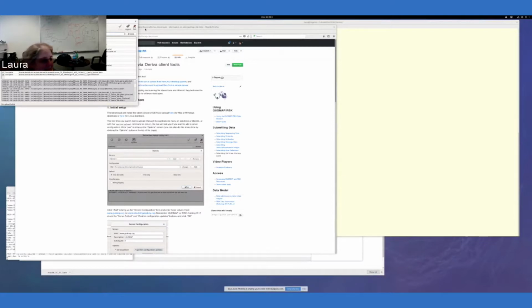You can log out and you can exit, but does anyone have any questions before I move on to the command line version?